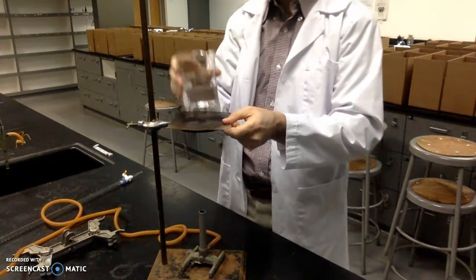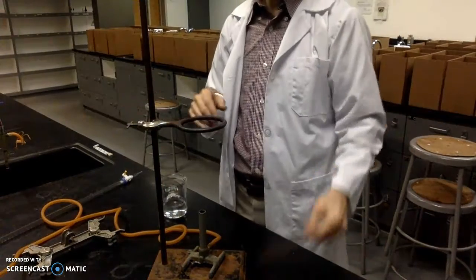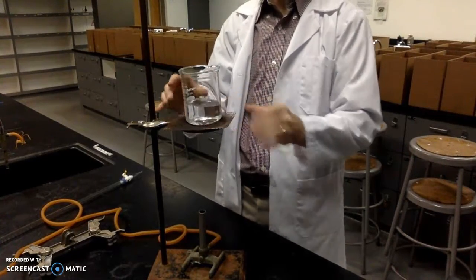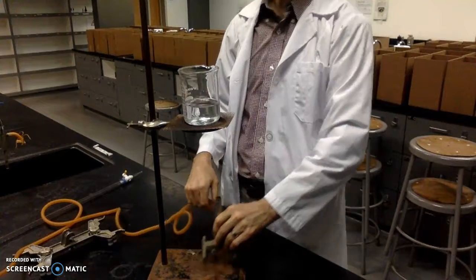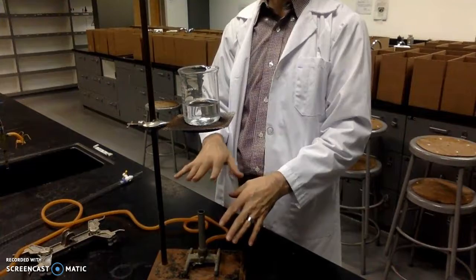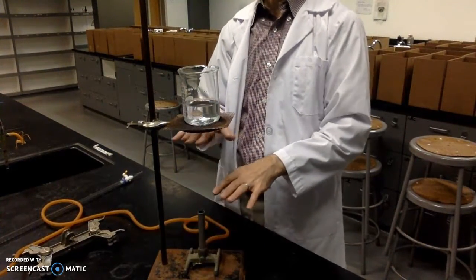You're going to have a ring. You're going to take your wire gauze. You're going to put it on top. And then you're going to have your beaker of water. And then of course you have your Bunsen burner, it's on, and then you want to make sure this is positioned so that it's not too close but not too far away. You're going to have to light the flame and see where the flame is.